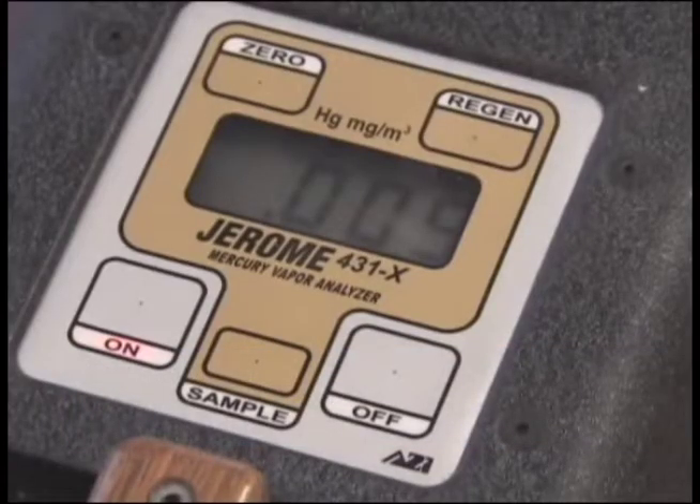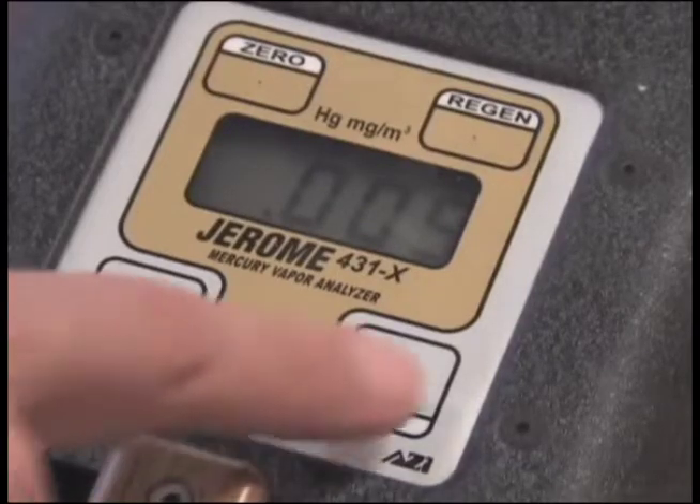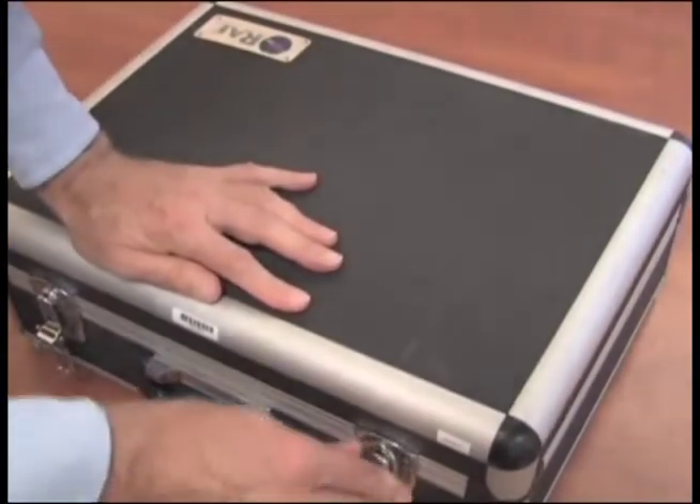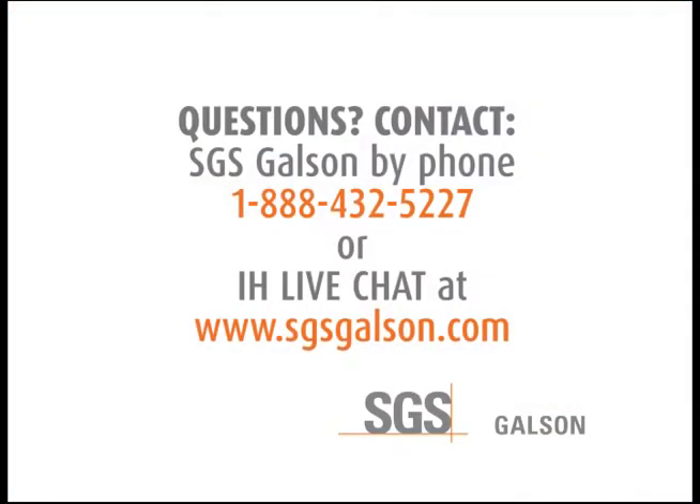When the survey is over, turn the unit off by pushing the on-off button. Remove the probe and repack for shipment back to Galson Laboratories.